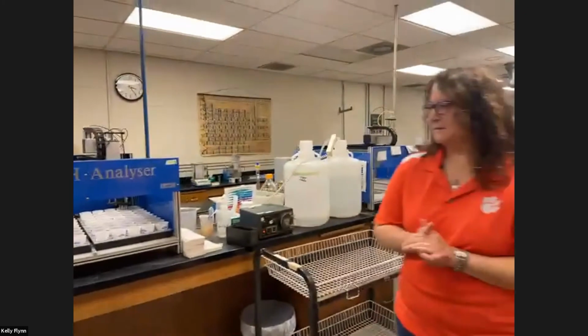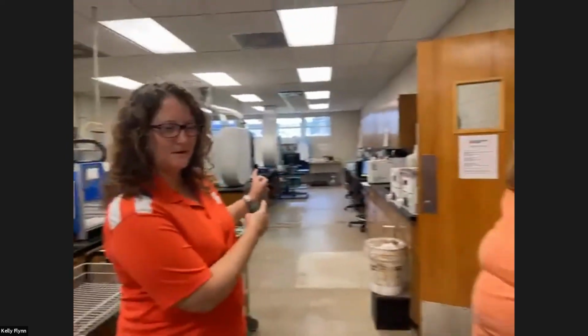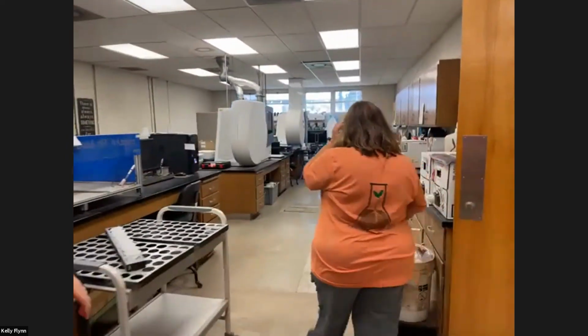Okay, so that's our pH analysis for soil. And remember, I talked to you about extraction, which is for the other part of our soil test, the nutrient analysis. So Amy, our chemist here, is going to talk to us about what we do there, but we need to walk down to another piece of equipment.